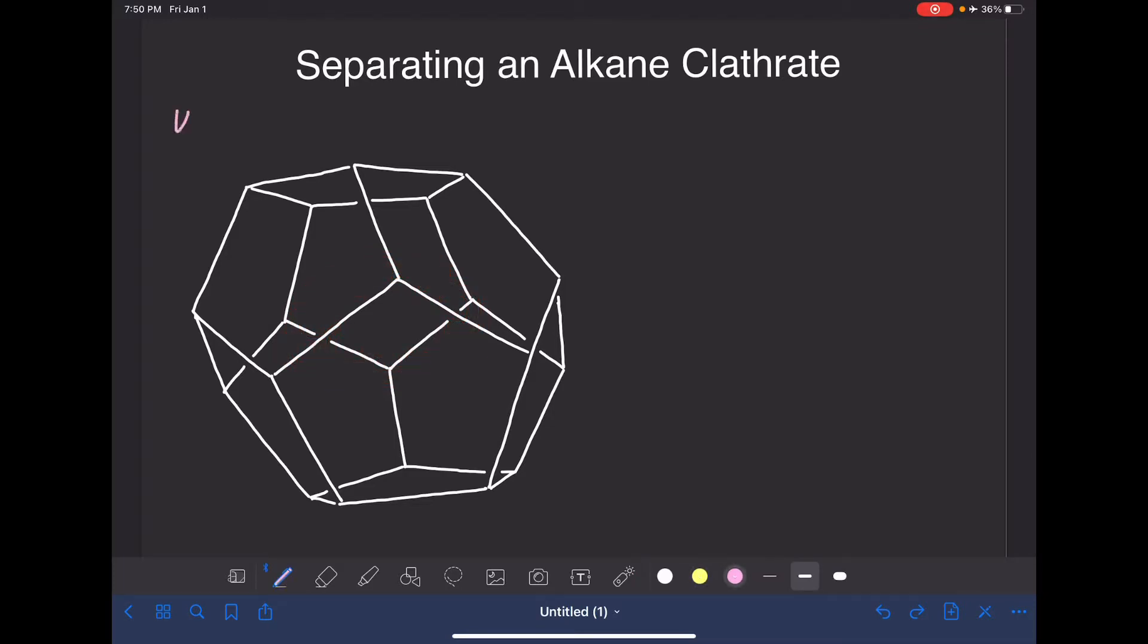In this experiment, we're going to be making a clathrate out of the urea molecule. Urea is a pretty small molecule, and so our clathrate will have its little urea molecules at every single one of the intersections of all of the faces of our clathrate. In this experiment, our goal is to determine what type of molecule is going to fit inside this urea clathrate, and we're going to try two different types of molecules that have pretty different structural features.